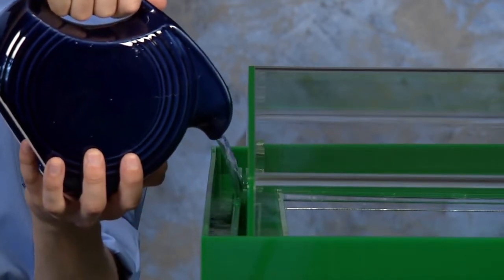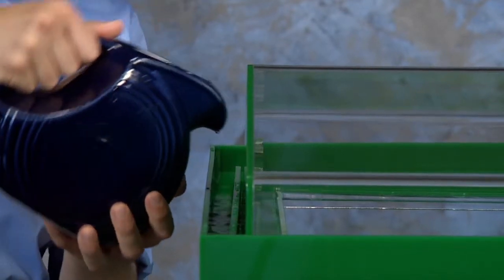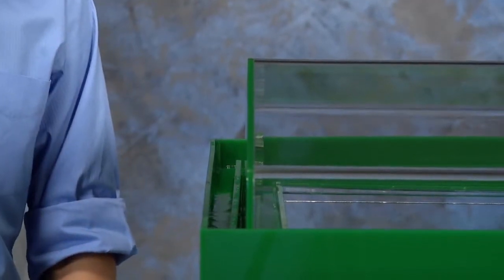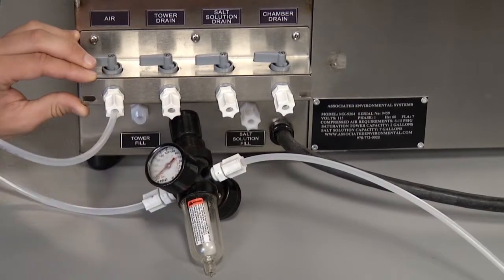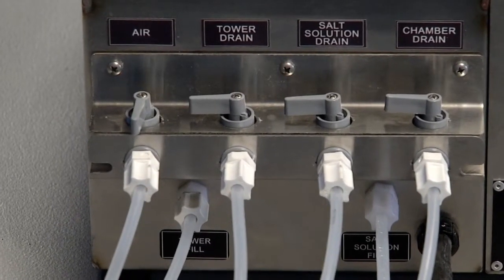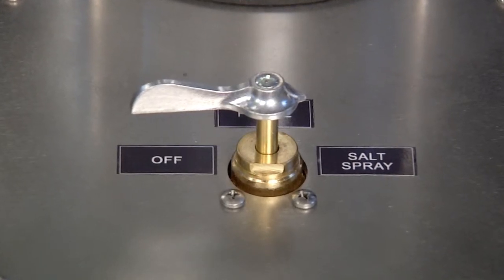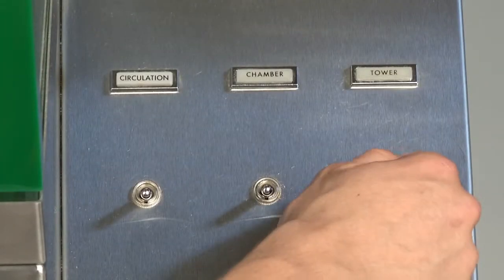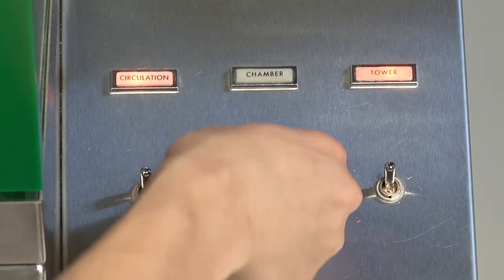The top cover of the chamber has a water seal to prevent salt fog from entering the room. Fill this trough periodically with distilled or demineralized water. It is important that the chamber be properly leveled in order to provide a satisfactory seal. Connect the chamber compressed air supply and ensure that the air is supplied at the correct pressure. Open the chamber air valve. Turn the compressed air supply on with the selector valve in the salt spray position. Place the tower switch in the on position, and place the circulation and chamber switches in the on position.